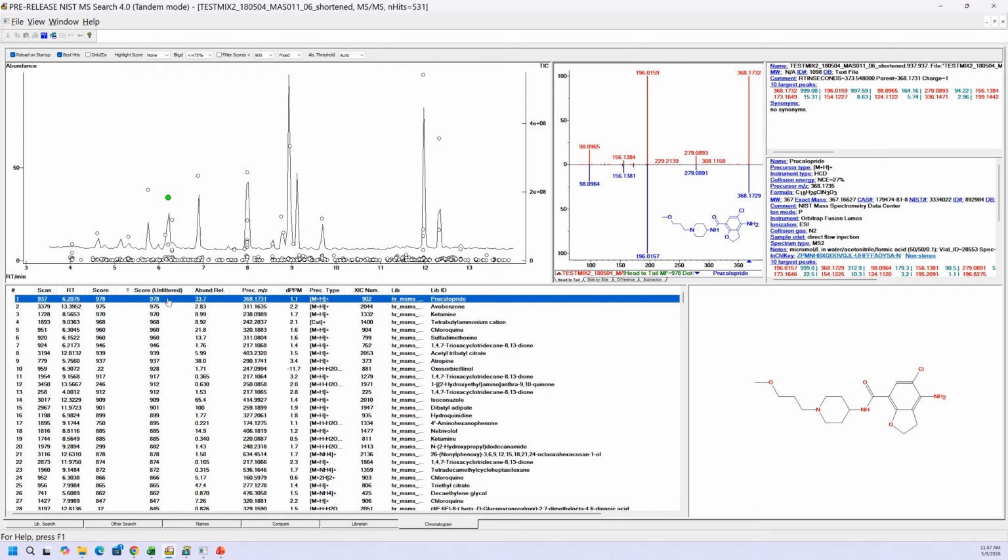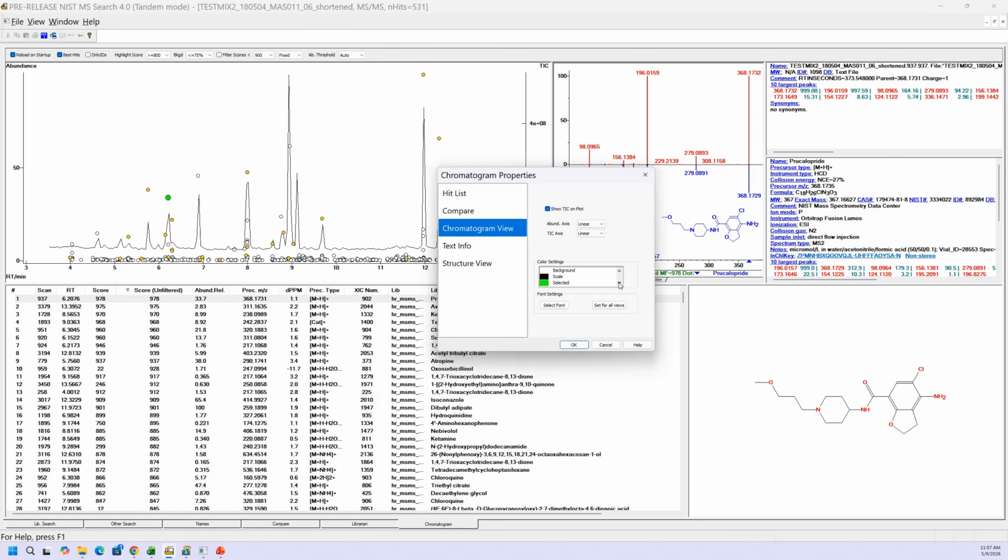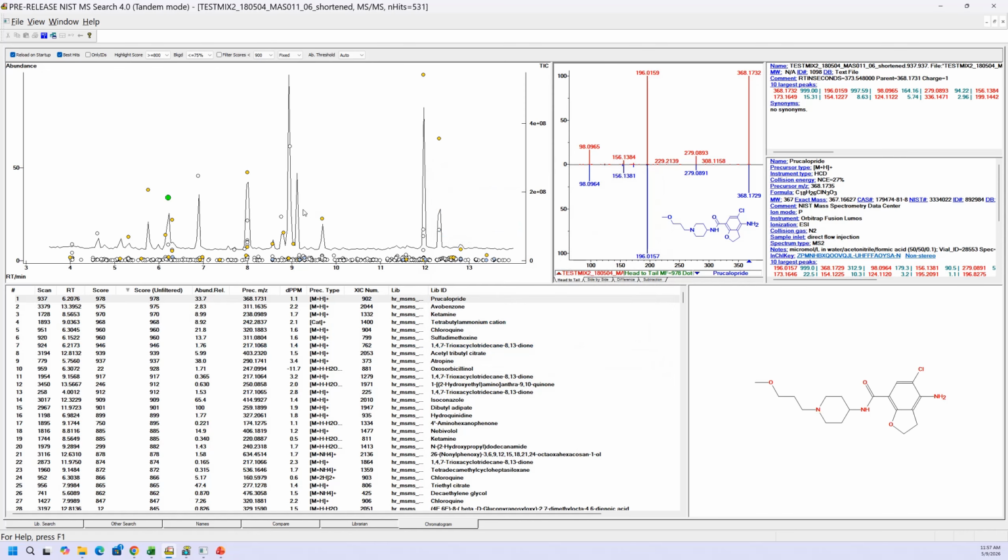If you want to see those, it's best to go up to the score, highlight it, and let's say pick all ions above 800 in our in-source. If we right click here and go to properties, you'll see what all the different little circles mean. The green is always selected, highlighted is this yellowish color, in-source will be blue, hybrids will be green. So now we'll have all of our in-source ions labeled in blue.